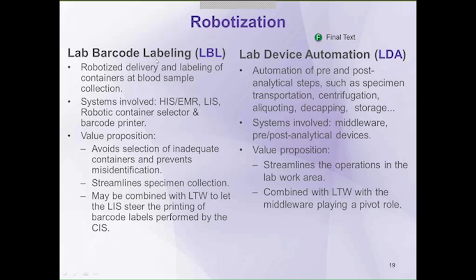And barcode labeling obviously has to deal with specimen collection and the labeling of the containers at the collection site. So then hopefully you don't have mislabeled and misidentified containers, because the labeling is part of the ordering process.